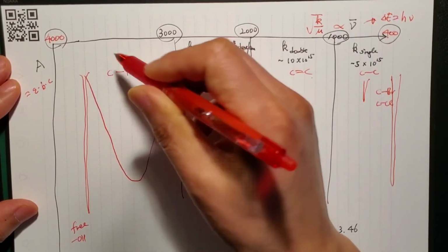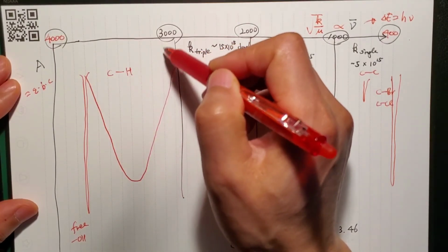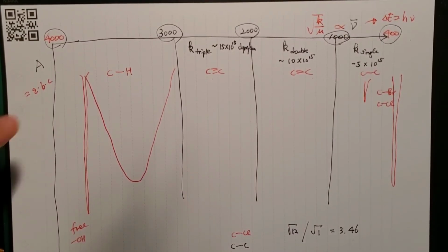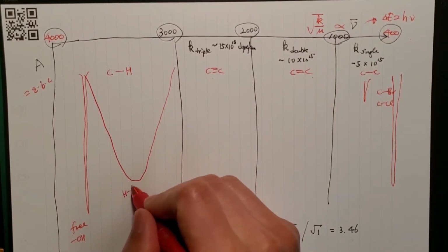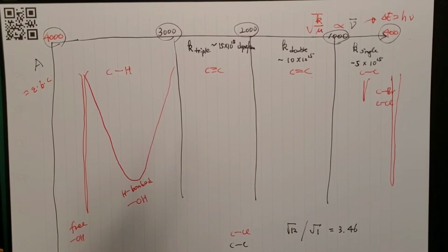So you have all kinds of frequencies absorbing the light, interacting with the OH bond in different strengths of the K value. So you will get a broad and yet strong absorption for OH. So this is an H bonded alcoholic OH functional group signal.